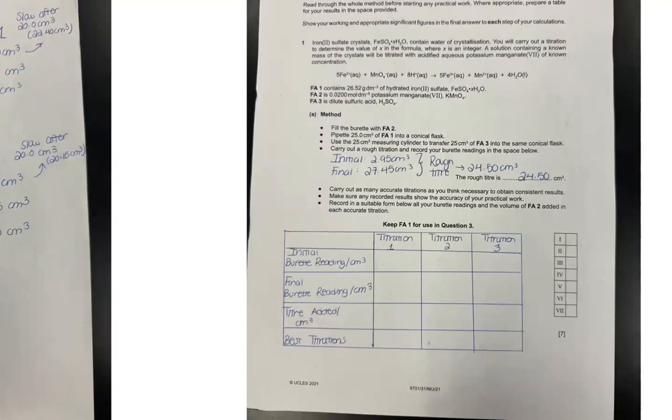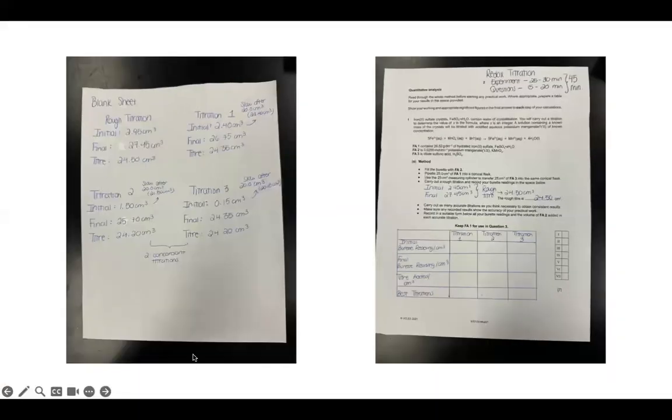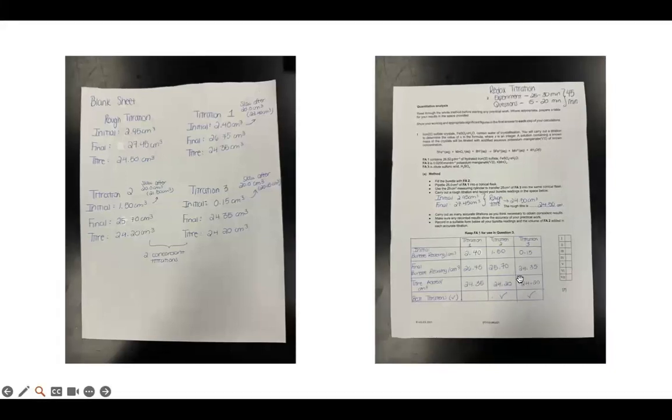So you have titration 1, 2, and 3, and then initial burette reading / the units, which is always centimeters cubed, final burette reading / the units, centimeters cubed, and then titer or FA2 added / centimeters cubed. Then you're going to add a final row that says best titrations. Thankfully, because we have our planning sheet, we can easily just put in these values in a matter of seconds and not have to scramble around our paper trying to find where we wrote the values.